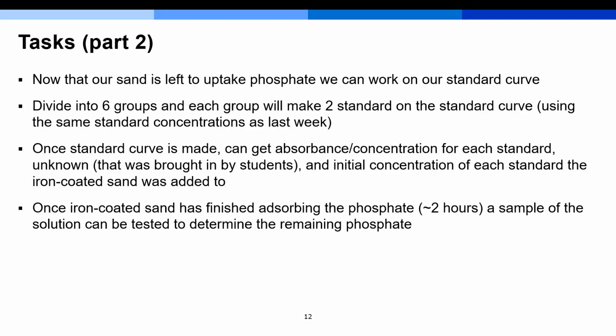So if you're attending the lab this week or attended it in the last 2 weeks in person, the other half of this lab will include making your own standard curve, just using the same concentrations and dilutions as for the previous lab. And then from the standard curve that's been made, everybody in the class will be able to test out the unknown that they brought in.